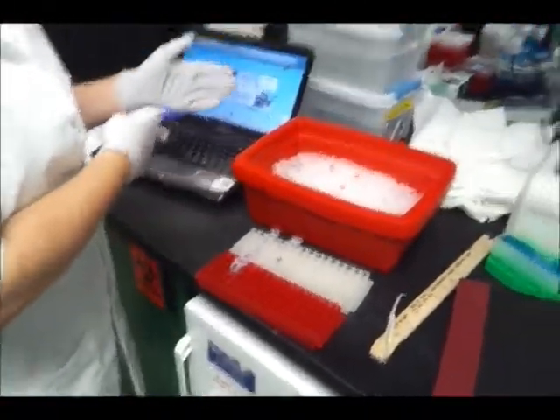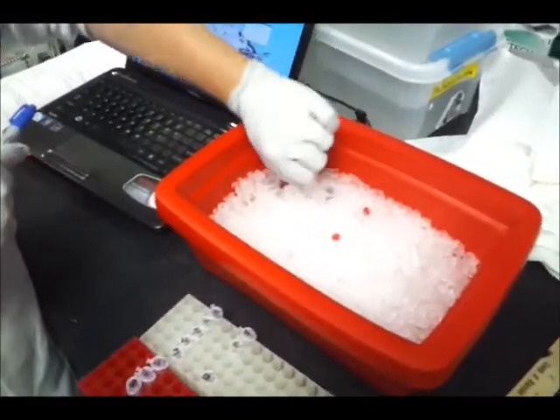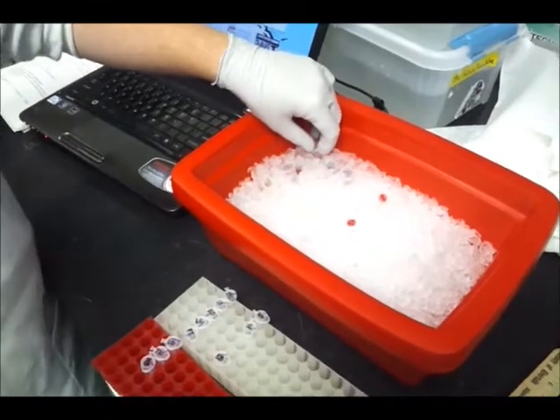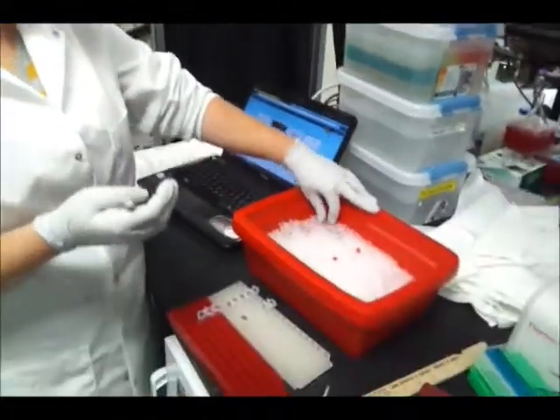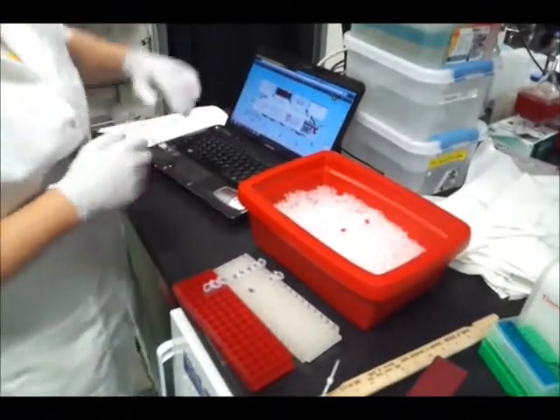The primers and the probes are in their big volumes right now, and I'm gonna probably go back into the PCR station and aliquot them into maybe 200 microliter aliquots, or something like that, so that we have them in such a way. But I'll do that once the UV is done in there.